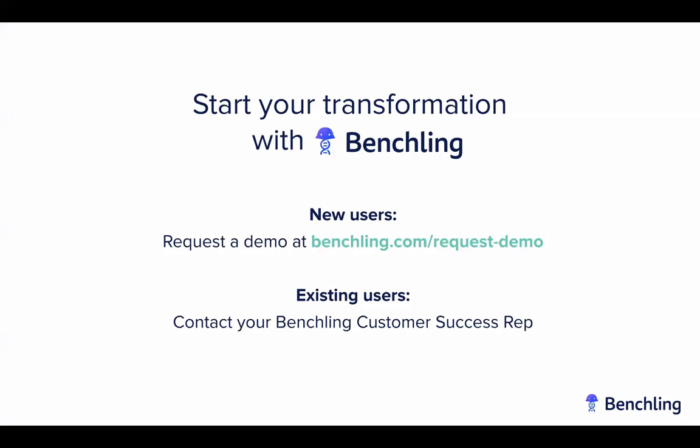Yep. And there were a couple of questions related to import and export formats. If you're exporting your files from Vector NTI or Geneious or other tools, will they be recognized natively? The short answer is yes, particularly if you're using open file formats like GenBank, which is a standard format. And we've built importers for application-specific file formats like Vector NTI and Geneious.